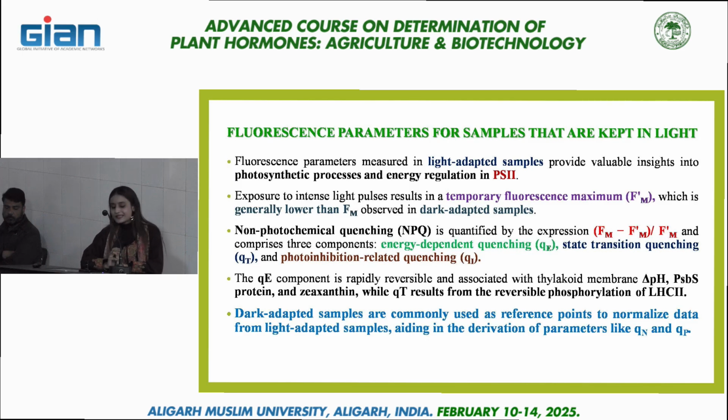Non-photochemical quenching, or NPQ, is quantified by the expression Fm minus F dash m upon F dash m, and comprises three components. One is QE, which is also known as energy dependent quenching, then QT, which is state transition quenching, and then QI, which is photoinhibition related quenching.